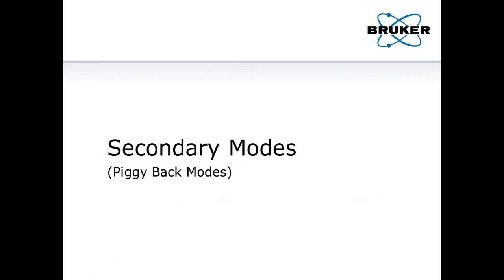Now what I have talked about is the major mode, or what we call the primary mode. AFM actually opens the door for you to know more, not only the topography.